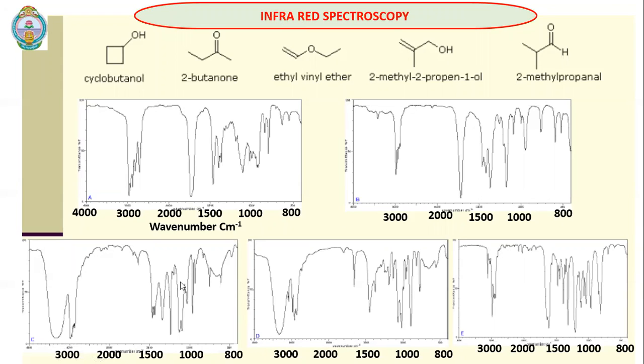Right. So when we look at these two, we can clearly say this is aliphatic CH, this is unsaturated CH. We have an additional band here. But here, you see, we don't have that, right? We have only aliphatic CH, and at the same time a broad hydrogen bonded alcohol band. We don't have hydrogens on a double bond, right? In this fashion, we can easily differentiate different compounds using their IR spectra.